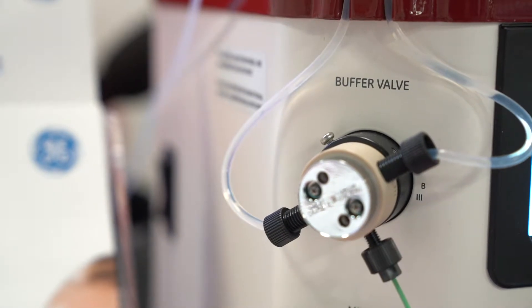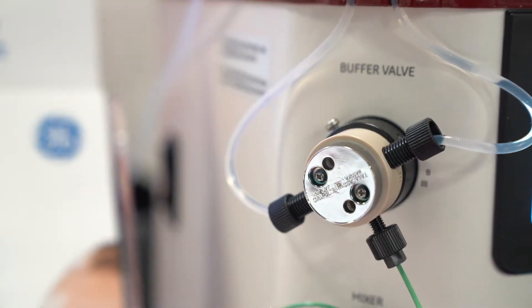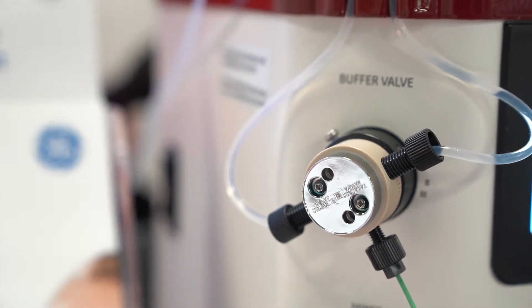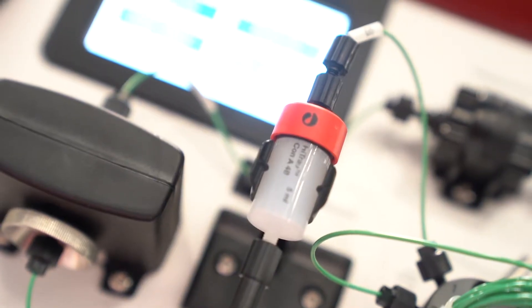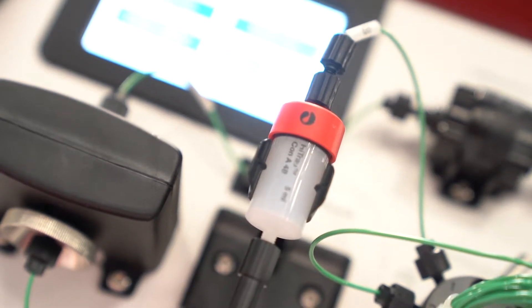A FRAC 30 Fraction Collector will collect your protein purification fractions as they come off the Acta. The Acta Start is ideal for purifying tagged and untagged proteins, desalting, and buffer and antibody purification.